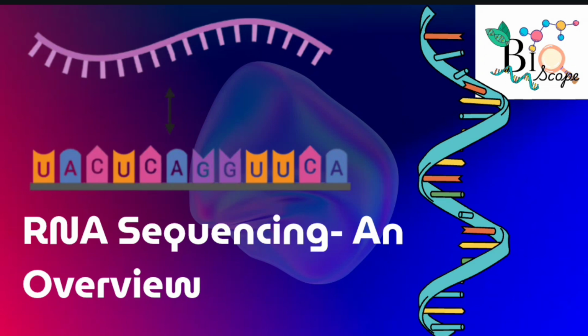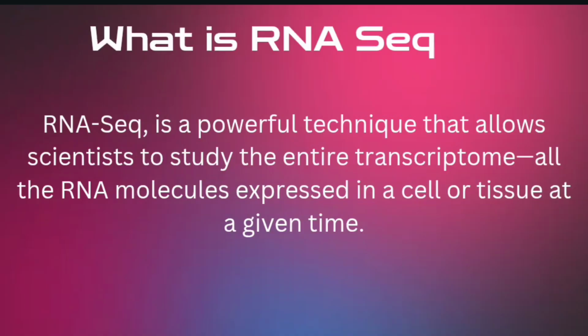and medicine. RNA sequencing or RNA-seq is a powerful technique that allows scientists to study the entire transcriptome, all the RNA molecules expressed in a cell or a tissue at a given time. It is widely used to understand gene expression patterns, discover new transcripts, and identify disease-related changes in RNA.